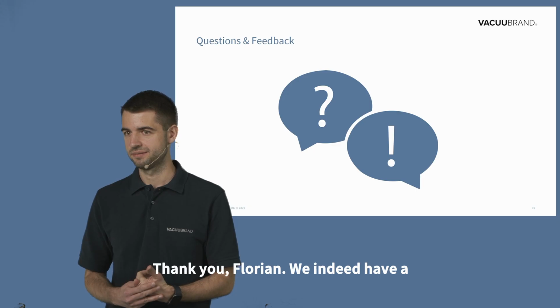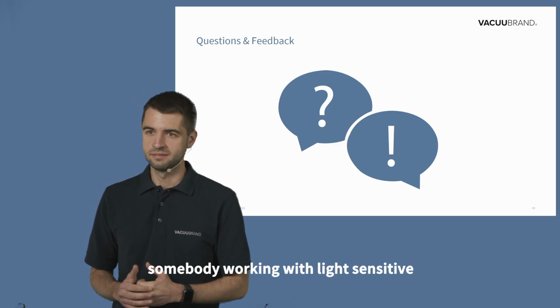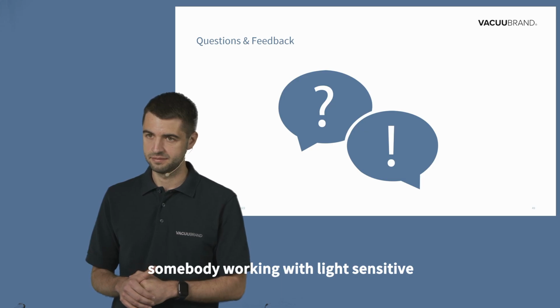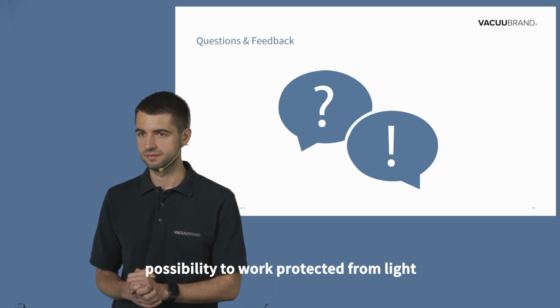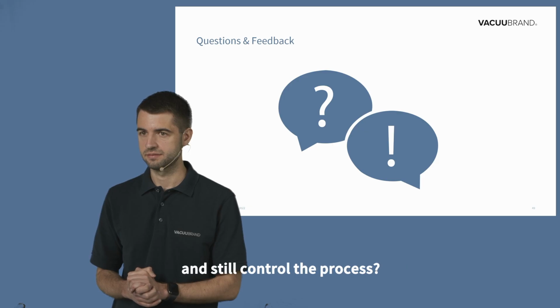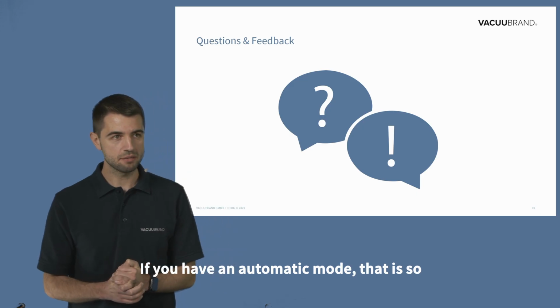Thank you, Florian. We indeed have a question from the audience. Somebody is working with light-sensitive solvents. So the question is: is there a possibility to work protected from light and still control the process, if you have an automatic mode, that is?